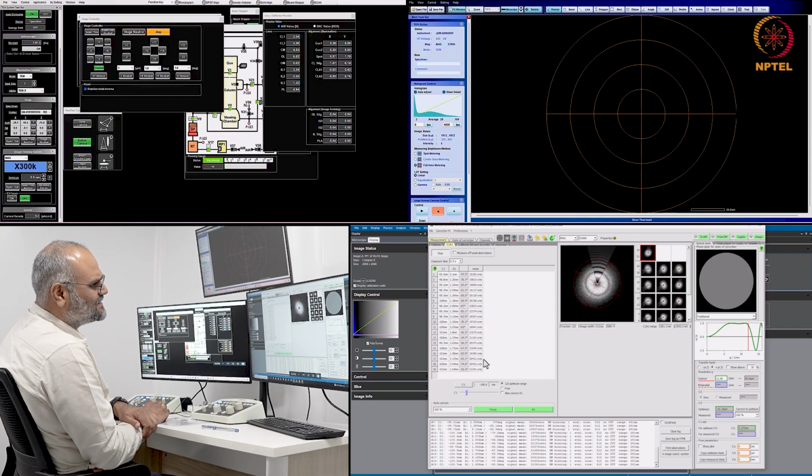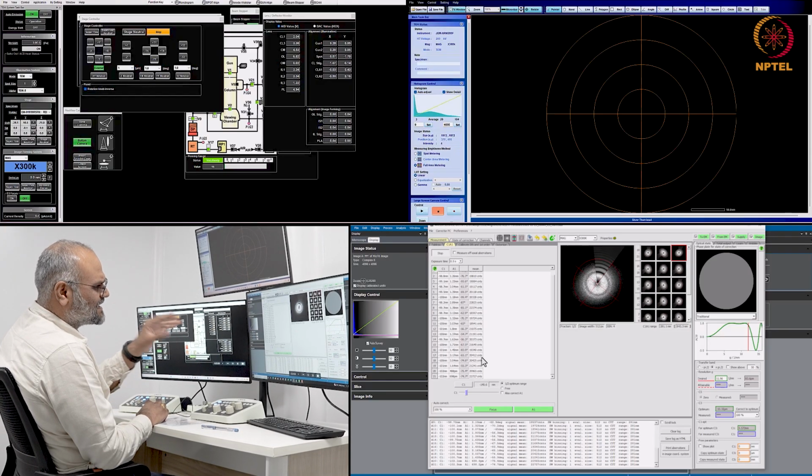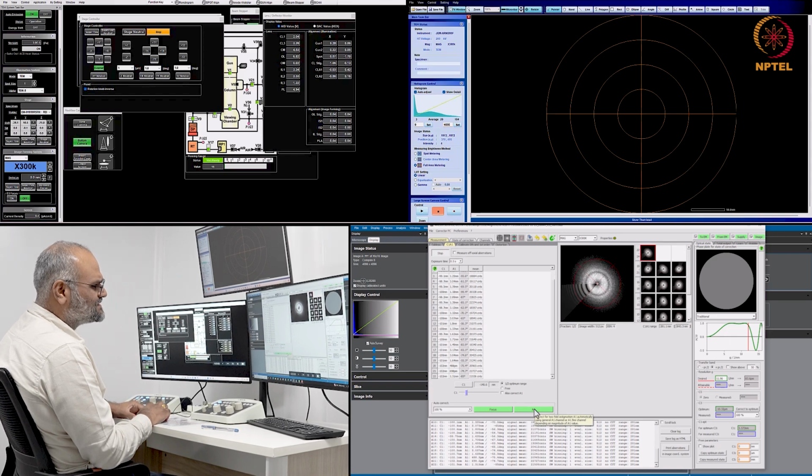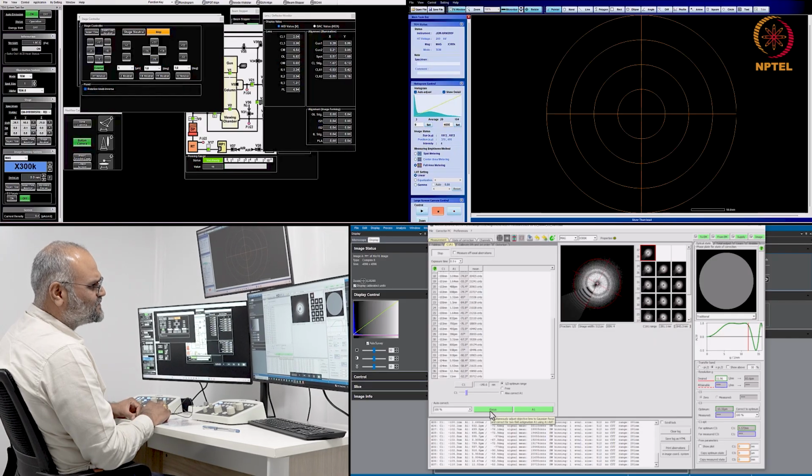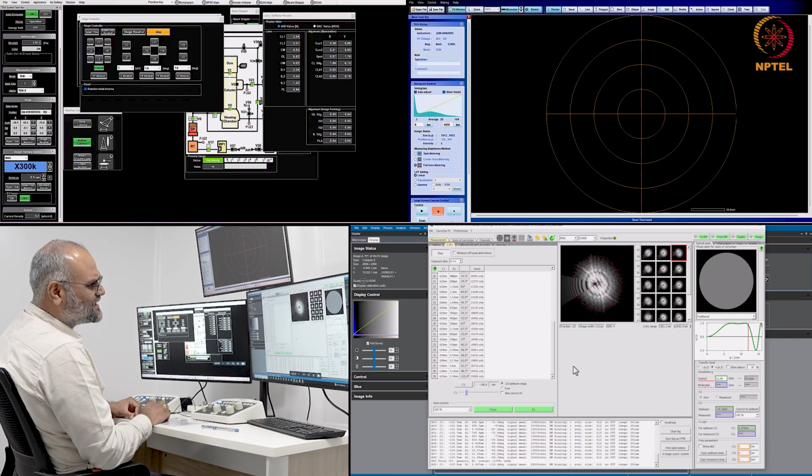So I can let this run for a couple of iterations, and I can press on this A1 and let us see how it corrects. It is consistently within the 1 nanometer range, and the focus is more or less lower than minus 140 nanometers, so you're almost within the appropriate range.